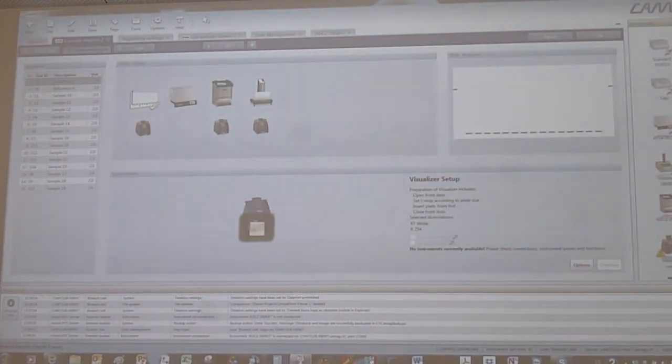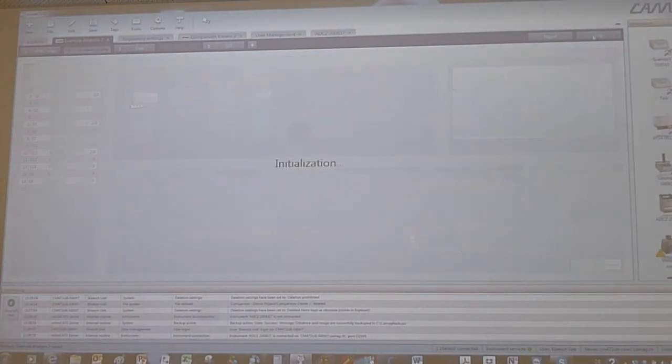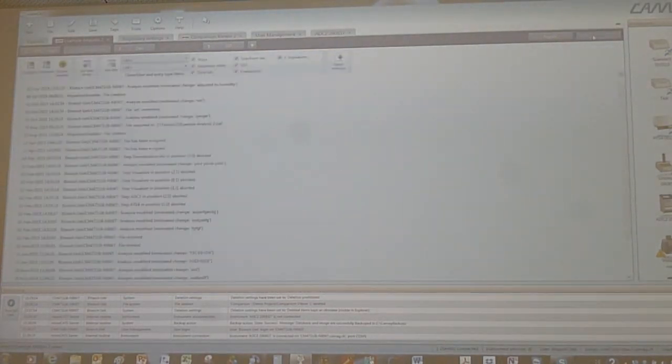And if I go now to the log file of this, with 21 CFR, log files are activated. The good thing is, if the customer decides the first year without 21 CFR, and then he decides, okay, now I want to go with 21 CFR, for all the analyses he made, log files were present. They were just not shown. So if he activates 21 CFR 11, he also activates the log files of the old files. So he will have all the data also from the old files.